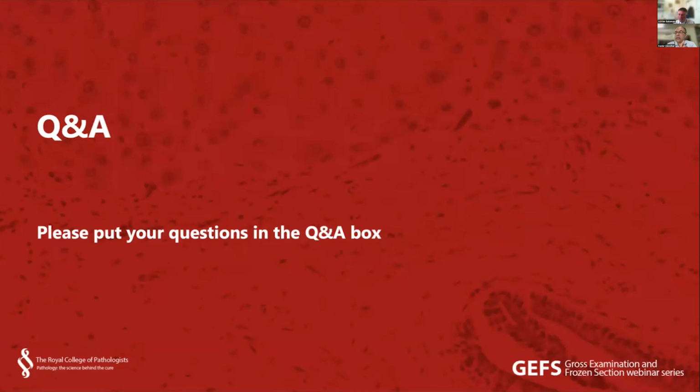Some people say, why do you need to take it? Well, the data set suggests you should still take it, because if it is involved, it has a slightly worse clinical outcome for the patient. But in practical terms, if one or more lymph nodes are involved, whether it's the high tie or not, the patient will usually be considered for chemotherapy in the post-operative period if they're fit enough. So if you can't find it, that's fine.